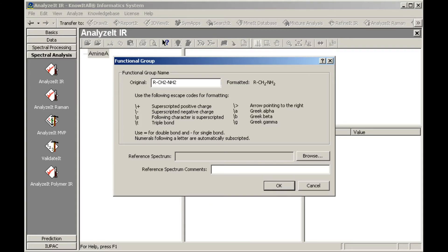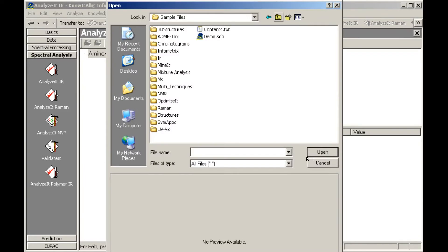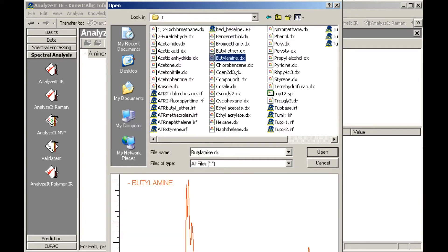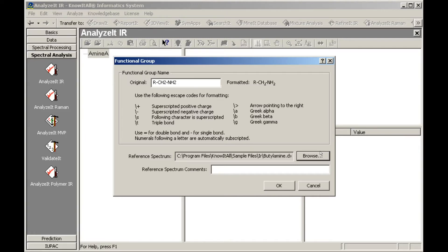Note that numbers are automatically subscripted, and other special formatting—superscripts, triple bonds, arrows, and Greek letters—can be added using the displayed codes. Next, we add a reference spectrum. We'll use one of the Know-It-All sample spectra in this example. Type in the comments text box to add information about the reference spectrum. We'll add the chemical name, but it could also indicate the source of the spectrum or any other pertinent information.